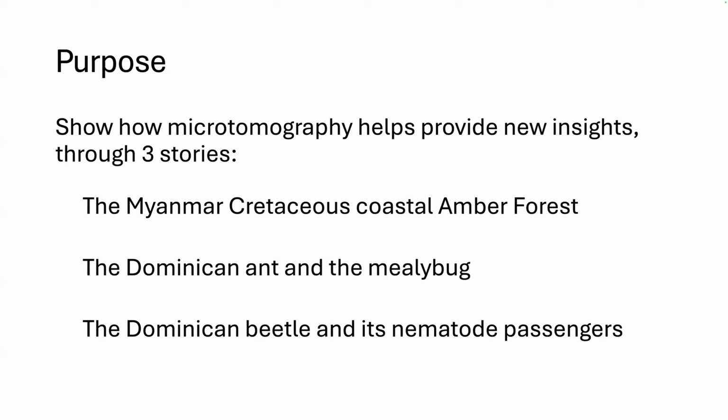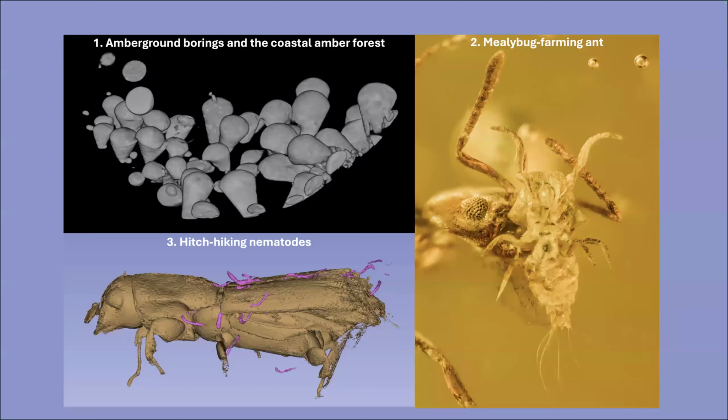So my purpose, I'm going to be using microtomography to show how we can derive new insights from new techniques of looking at things through these three stories: a Myanmar Cretaceous coastal amber forest, a Dominican ant and a mealybug, a Dominican beetle and its nematode passengers. But it occurred to me that it's not just about this technology, and in that spirit of playful, curiosity-driven exploratory science, you never know what you're going to find, and sometimes it's valuable as a complement to other techniques, and we'll be seeing that as we go along.